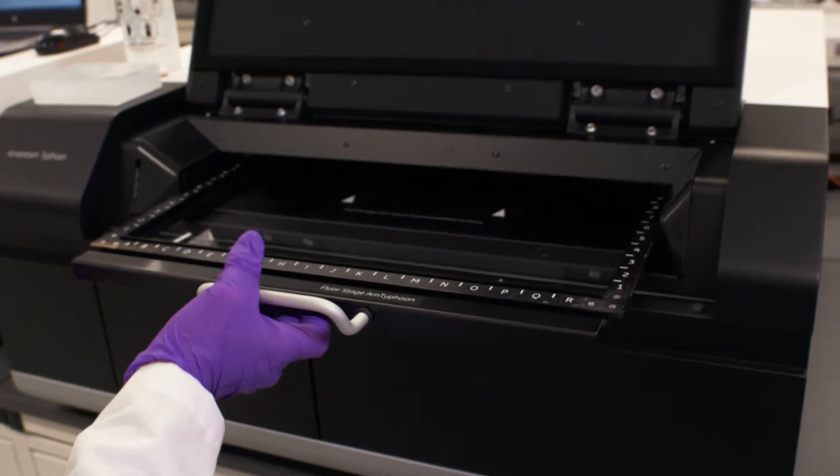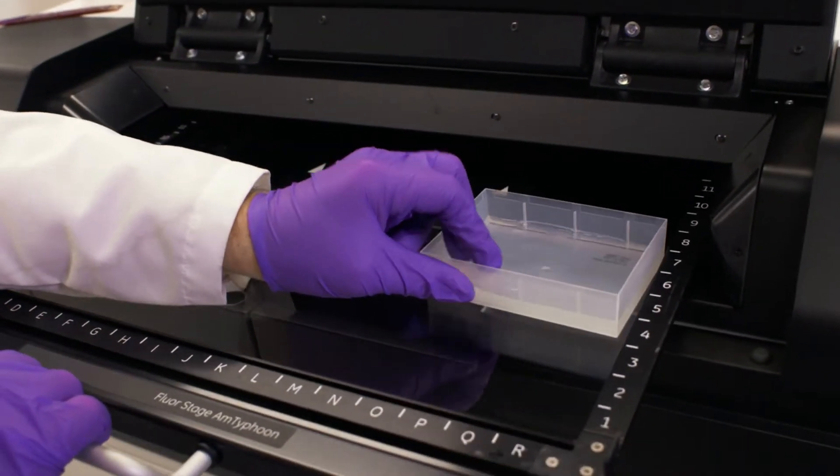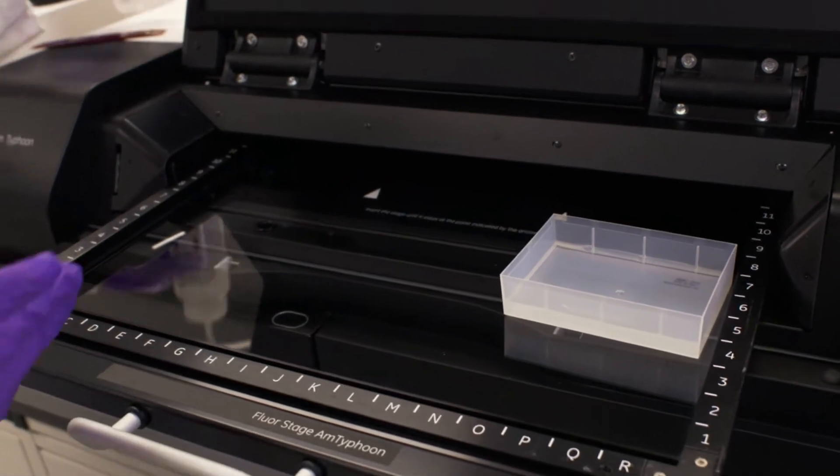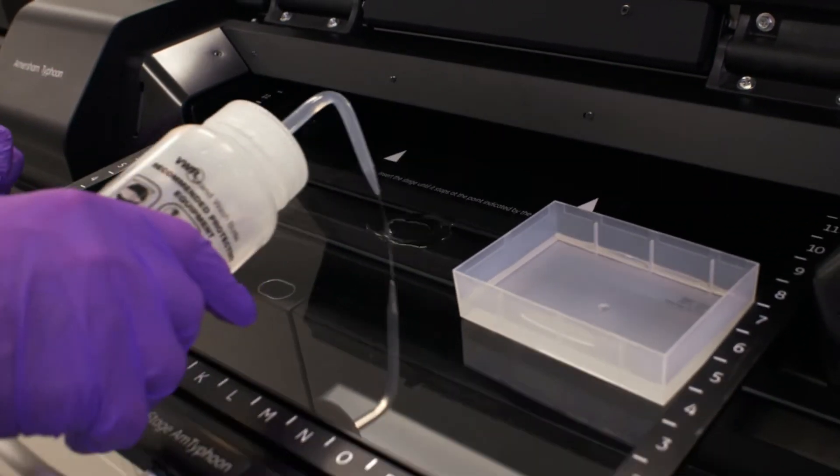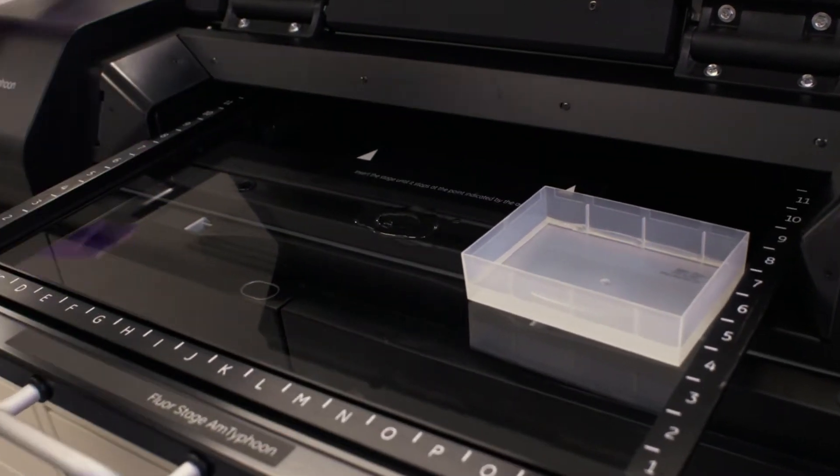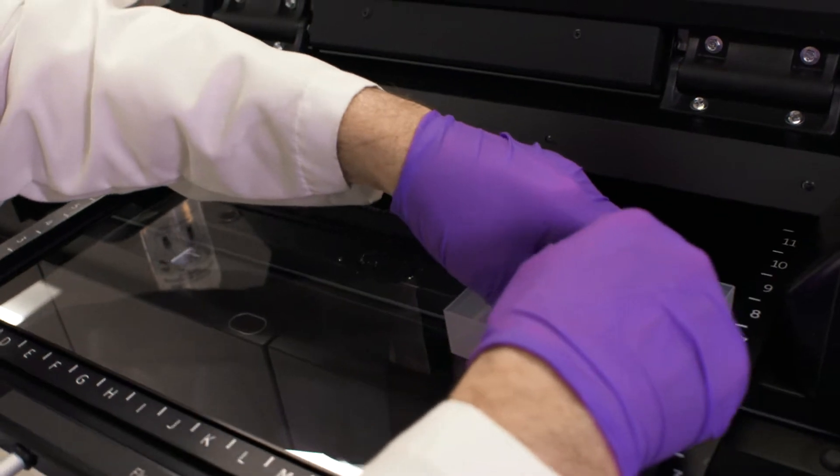In this case, we're going to work with a Coomassie stain gel. You can place the gel here to make it easier to work with, and it usually helps to place a little bit of water onto the platen. It's better to work towards the middle to get a more uniform signal and avoid any feedback you might get on the edges.